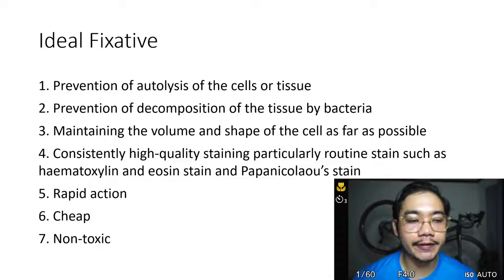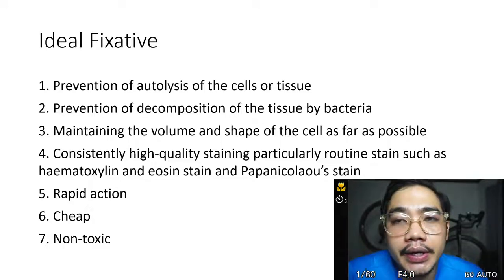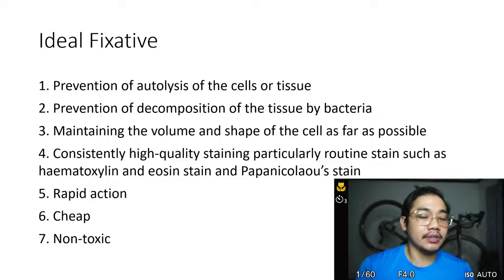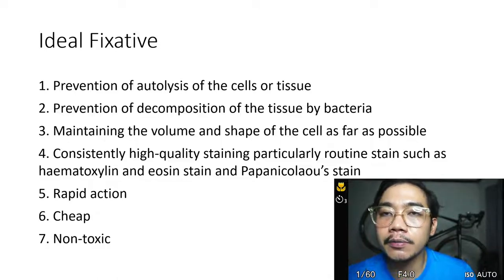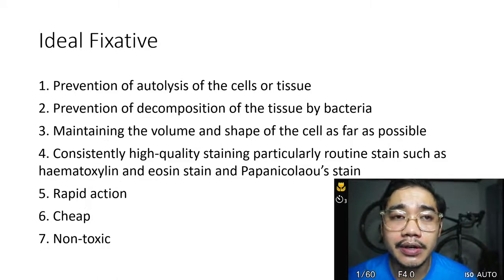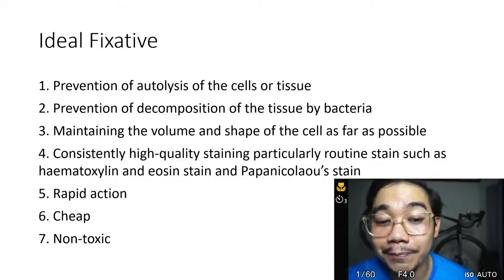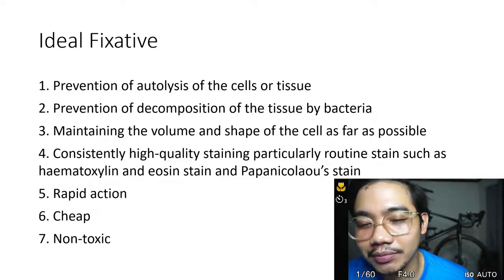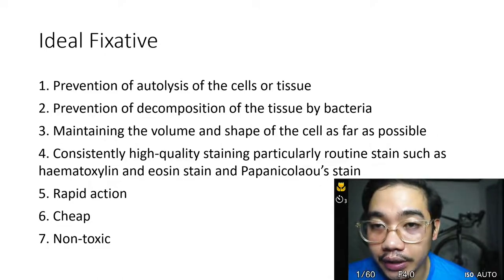Okay, so the ideal fixative. What is the ideal fixative? If we have an ideal person, then we also have an ideal fixative, no? So the ideal fixative, of course, in the process, the ones who made this list are most probably from a first world country. So their primary objective is to make it as much as possible so that they really preserve their tissue.